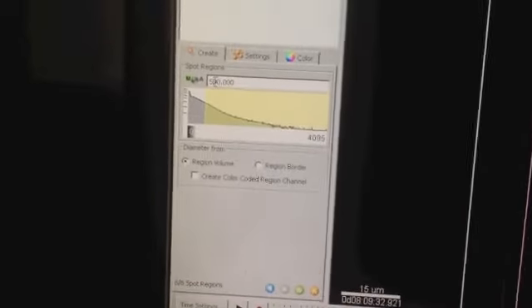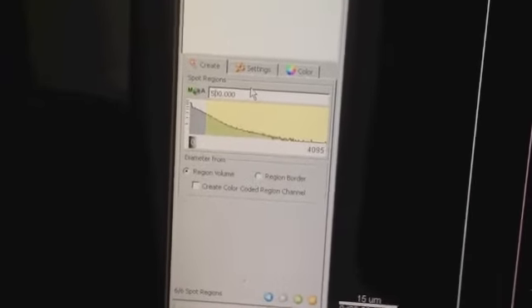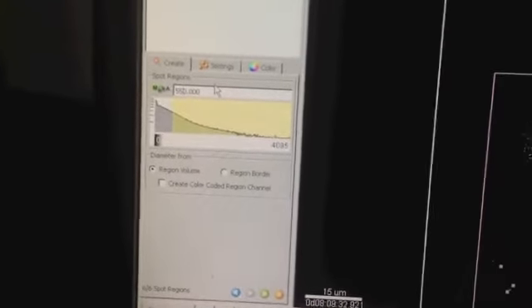So you can see here, for example, it's a little bit much out in the cytoplasm there, so we might increase this back up to 550. Go like that. Okay, so that's now looking like that. I'm reasonably happy with that. You could increase it to 600 if you really wanted, but I think for this it should be okay.